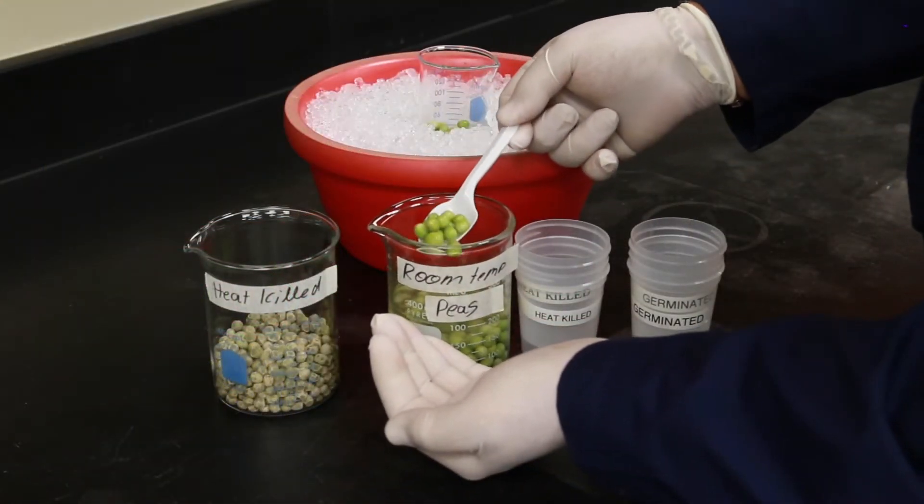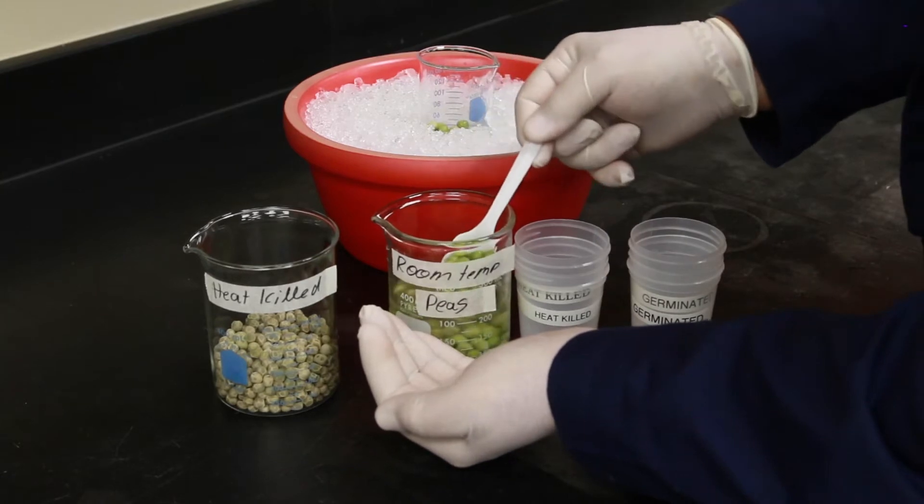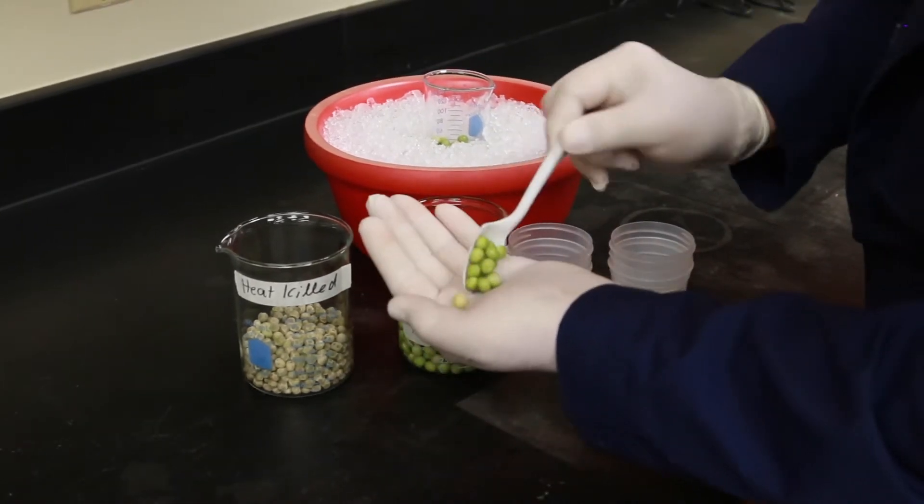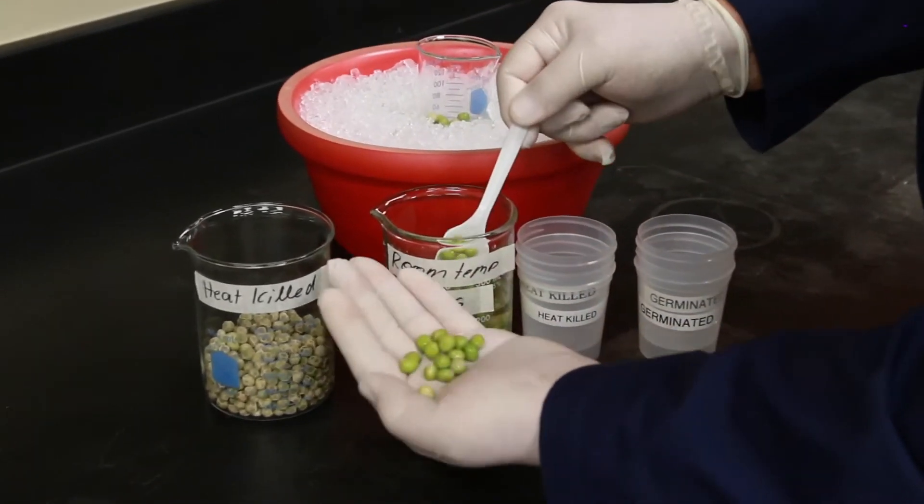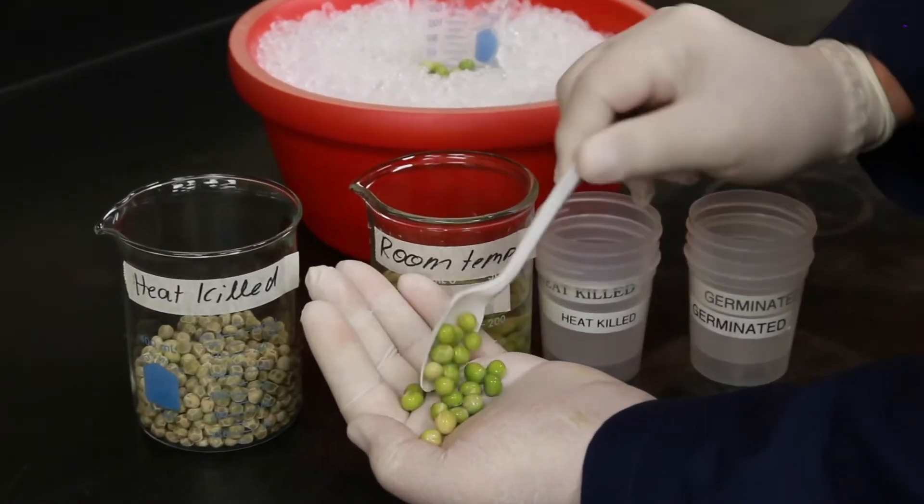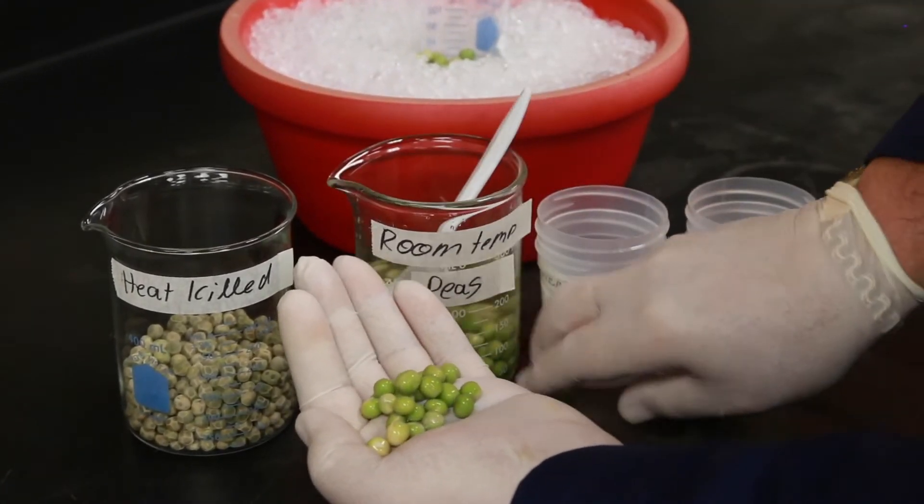To begin this experiment we first must count out 25 peas. Now these are peas that have been germinating at room temperature for about three or four days. They're simply soaked in water but they have begun the growth process.